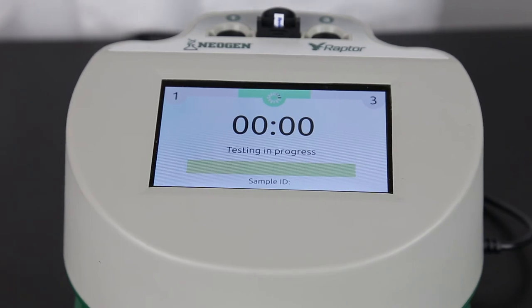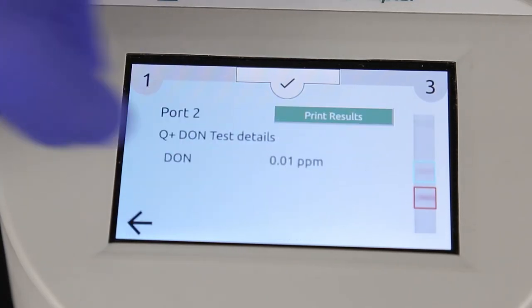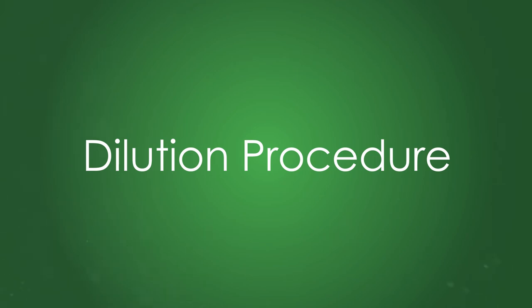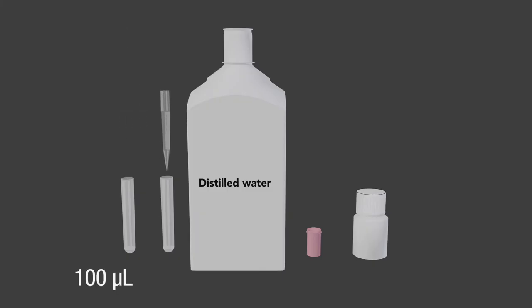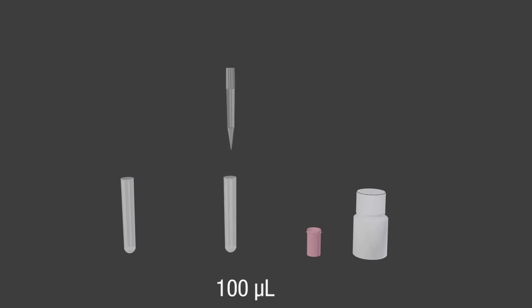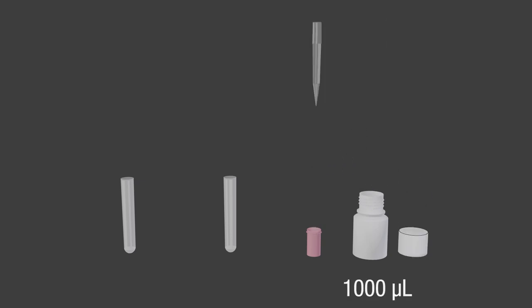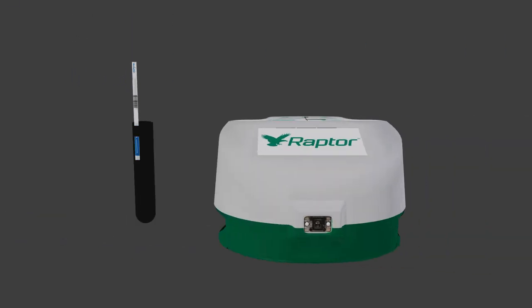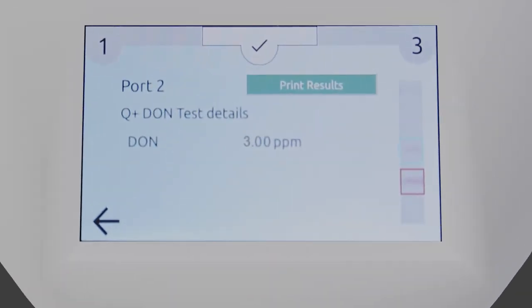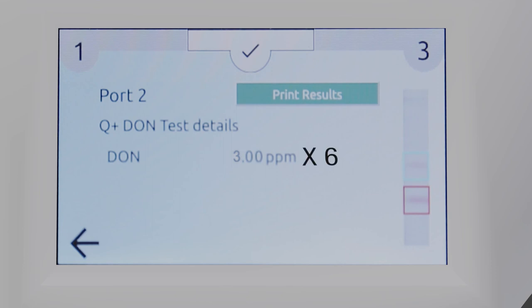After the three minute testing time, the Raptor displays your results. For samples greater than 6 ppm, you will need to dilute and retest. Add 100 microliters of sample filtrate to a sample collection tube. Add 500 microliters of distilled water and mix well. Transfer 100 microliters of the sample dilution to a red dilution cup. Add 1000 microliters of sample diluent and mix well. Place the Raptor cartridge into the port and add 400 microliters of sample to the cartridge. The result will be displayed. Remember to multiply your result by the dilution factor — for this example, multiply by 6.